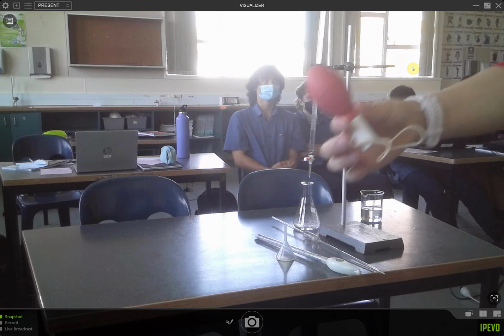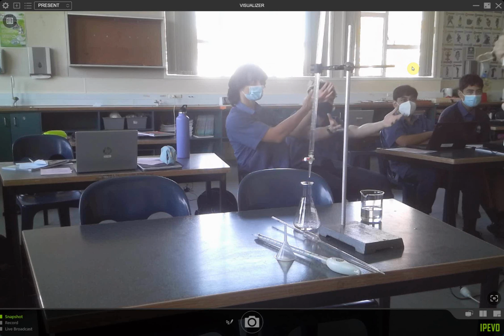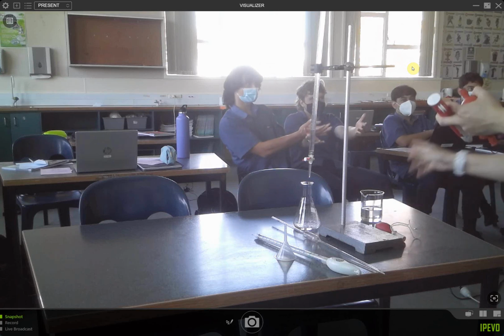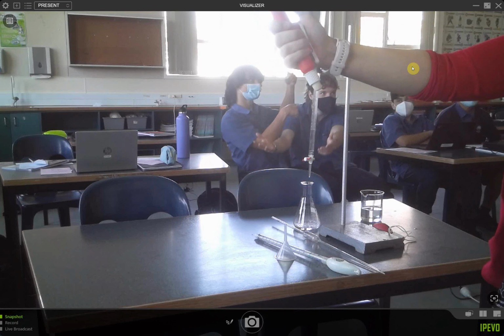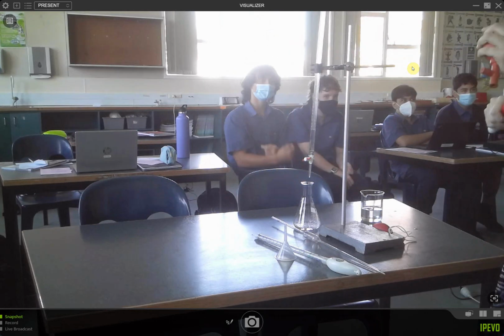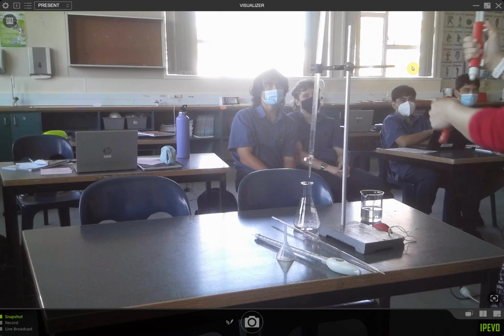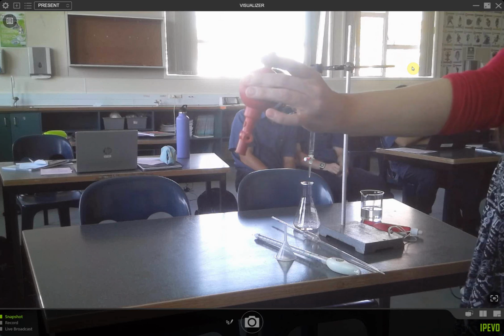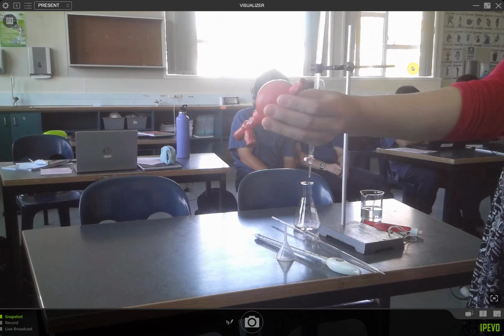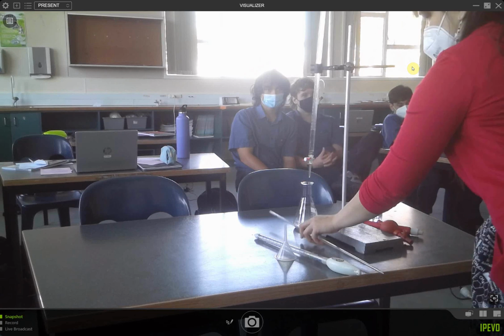This bulb is your first choice, if you like that. This one you just suck up. You have very little control. This one here is like a crank, so you pull the solution up that way. I don't like this one, because sometimes you don't get enough solution, and then you have to pull it off, do that, and put it back on. All right, and this one is probably my favorite because it allows you a lot of control. Actually, between these two are probably the two best ones. I'll take this one though, because I think this one's better.